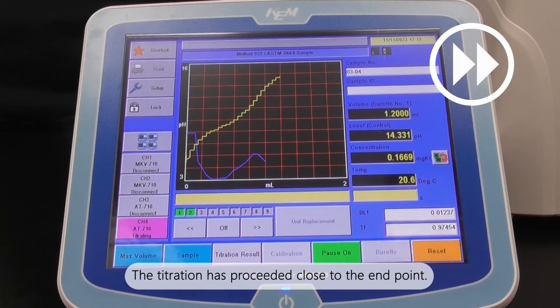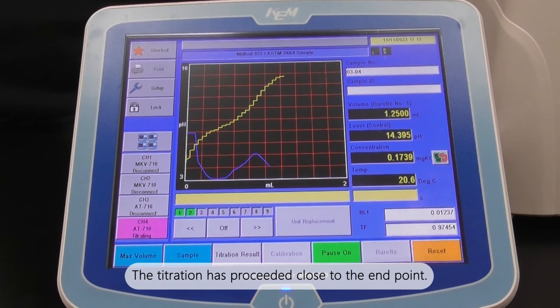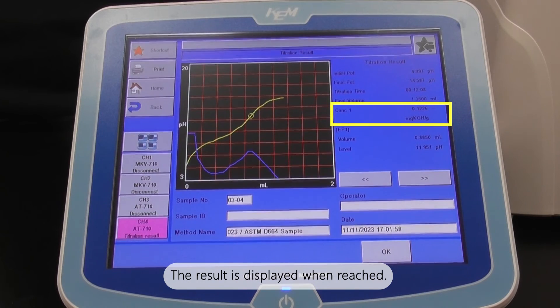The titration has proceeded close to the endpoint. The result is displayed when reached.